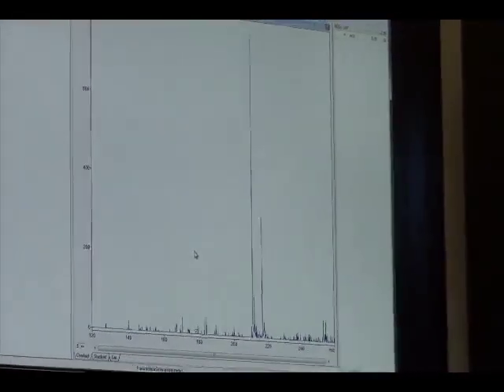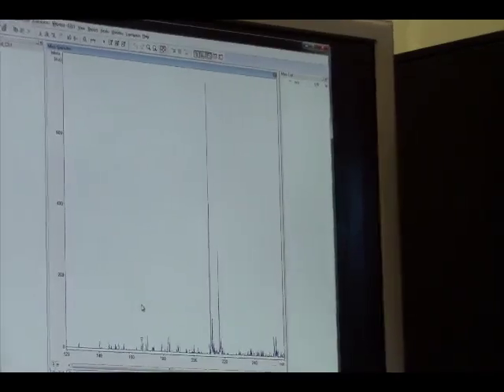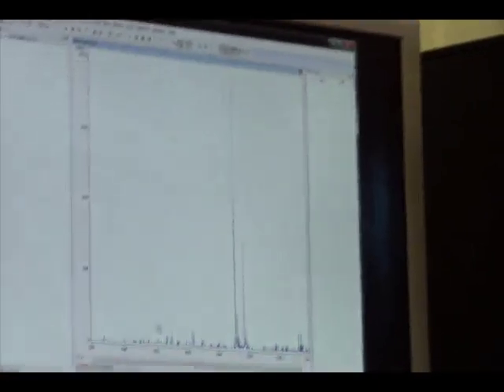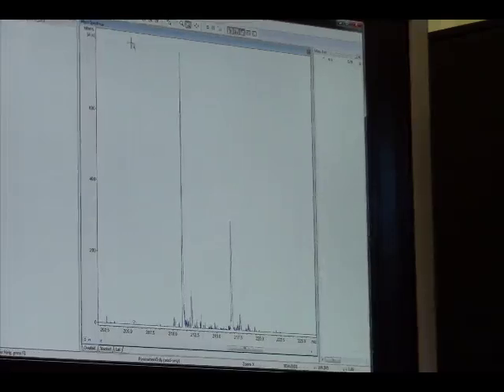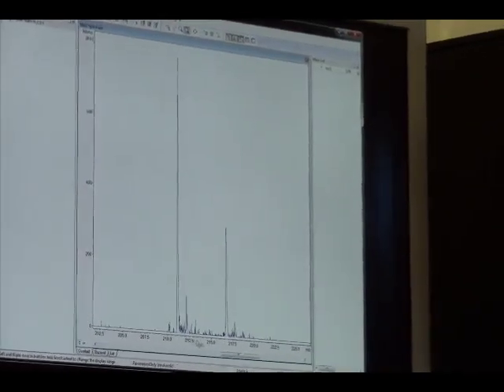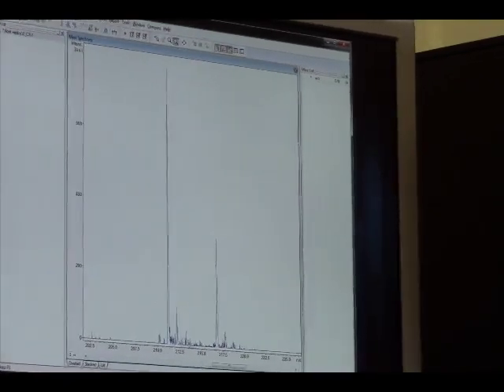Now, from before, positive mode should have a sodium on there, so it was 170 something. We don't see a lot in the 170. What's this? Huh, that's interesting. This has a mass unit difference of, what, about 6?